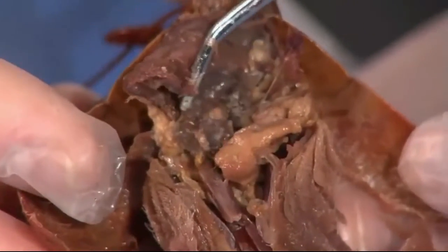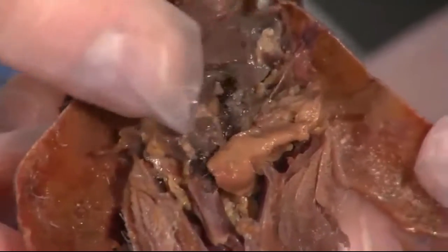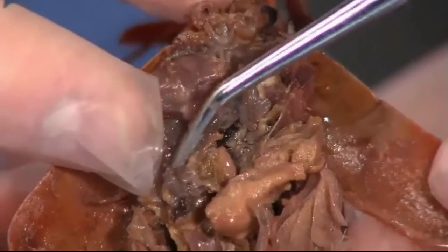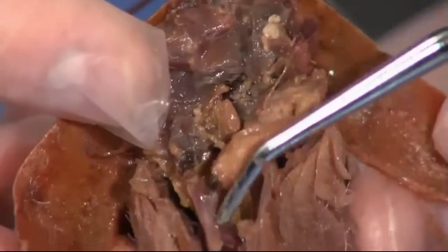And then the stomachs again — here would be the cardiac stomach in the front and the pyloric stomach in the back, which will then push on into the intestine.